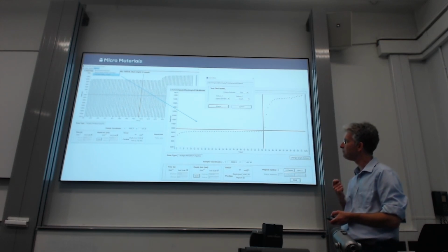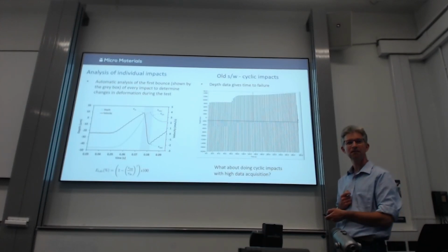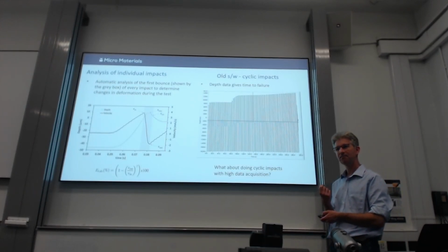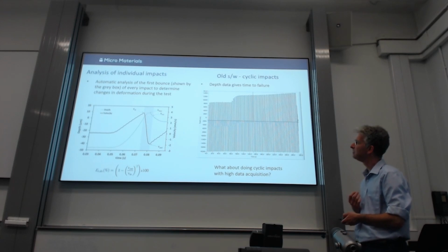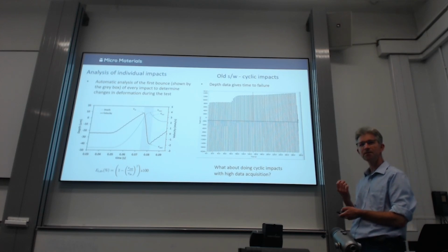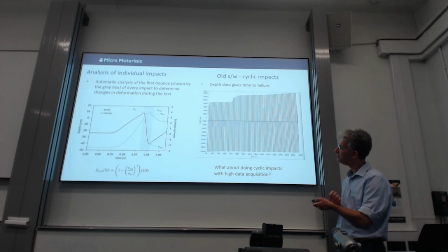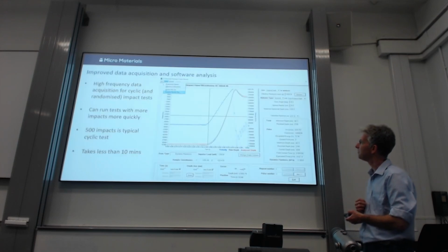But what's an even bigger step forward is to say, well actually, what about doing this whole thing at high data density rates? Because then we've got all of these additional metrics to play with, to look at, to understand how the damage kicks in. And that might be useful because we might see, for example, some subsurface damage throwing out, in terms of the output velocity, that we don't necessarily see in the depth straight away. So we have a subsurface crack network or something like that.